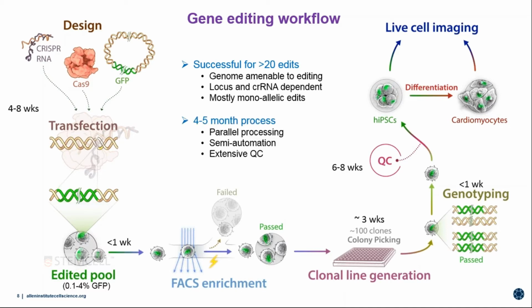So this takes a long time. The actual editing itself is probably a week or two. That's not where it takes a lot of time. It takes a lot of time to design this, do the right research, and get the high quality reagents together before we even go into the lab. And then of course we spend about 2 months doing various QC.